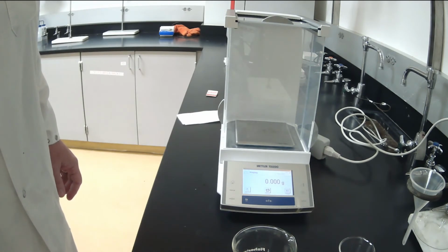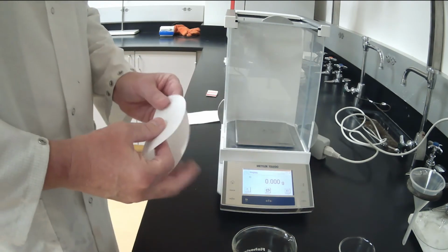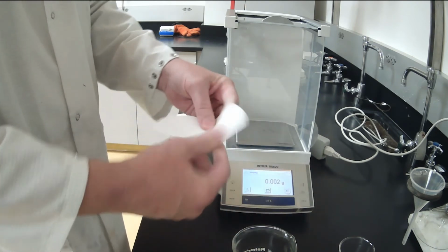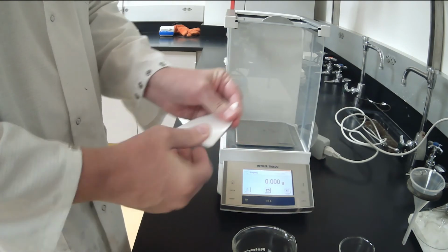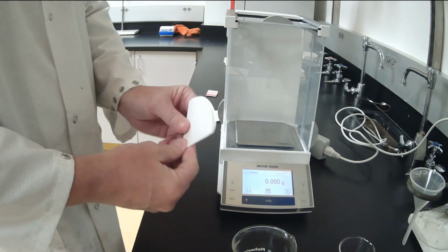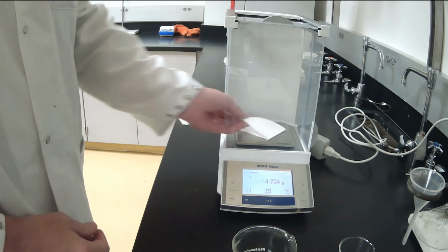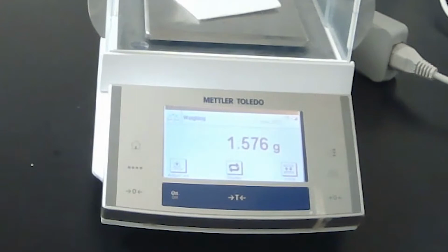Now the other thing we need to weigh is a piece of filter paper. With the filter paper, we're going to create a cone shape by folding it once and then twice. Now, some people say you're supposed to tear the corner. I never recommend doing that. So I folded the filter paper. Let's now weigh it. And where it says filter paper in your notebook, please record the weight of the filter paper. Can we see that number?